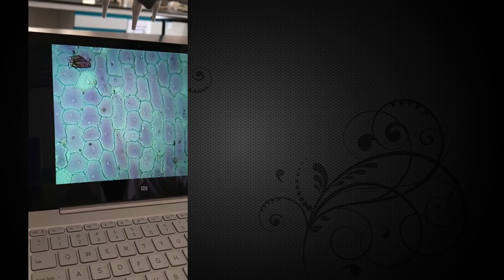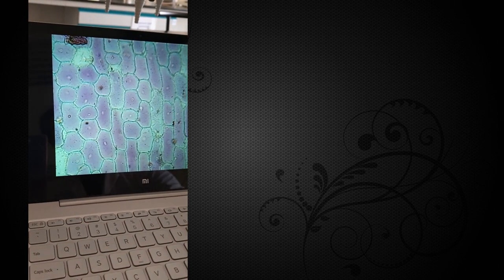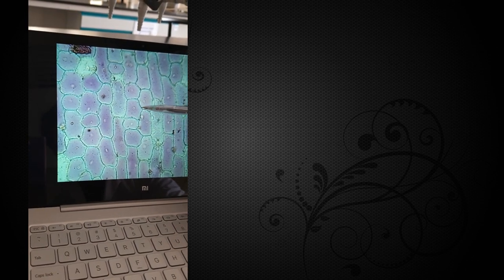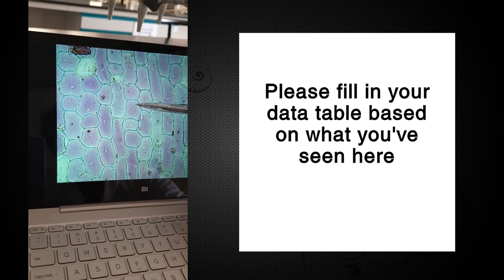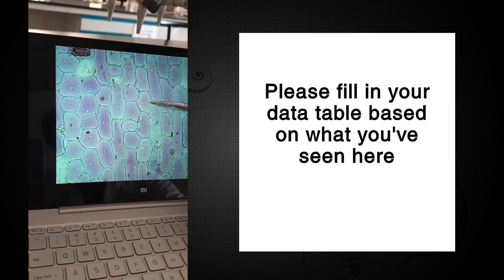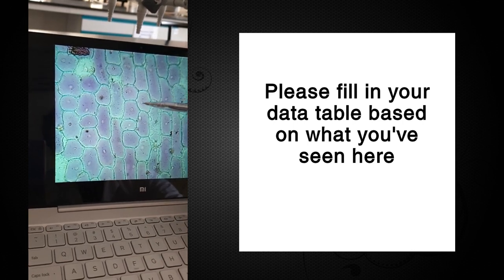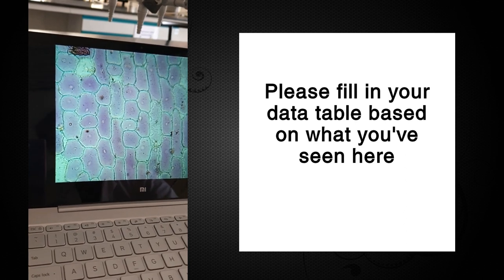You can see here. You can see the outlines very clearly. These are the cell walls. And you can see that filling in these cell walls, the space completely are these pink cells. You can see the nuclei here fairly clearly actually as well. So all of these are the nuclei of these cells.